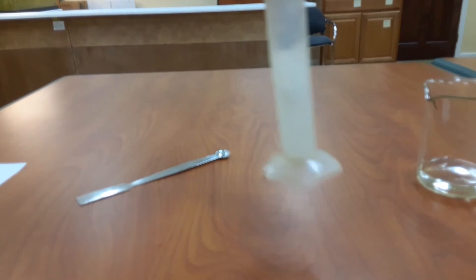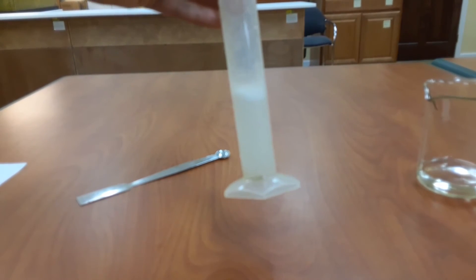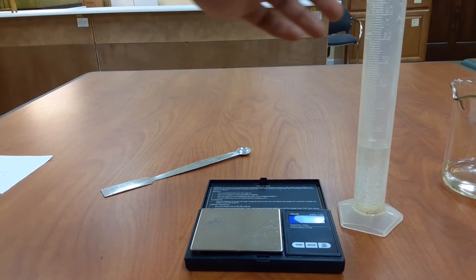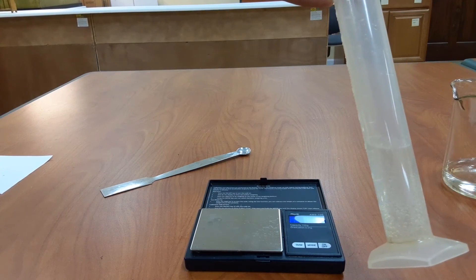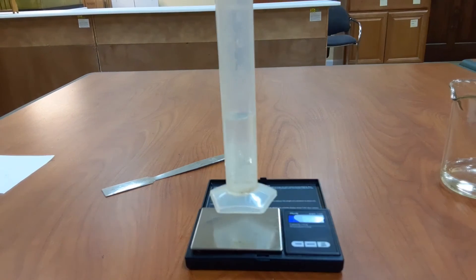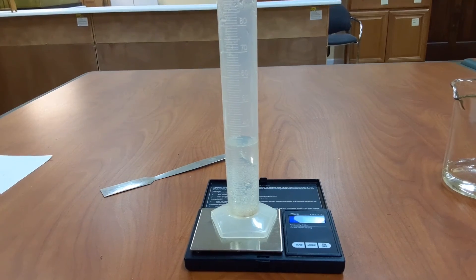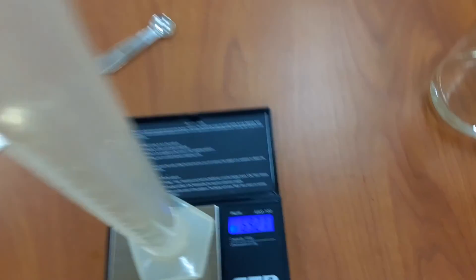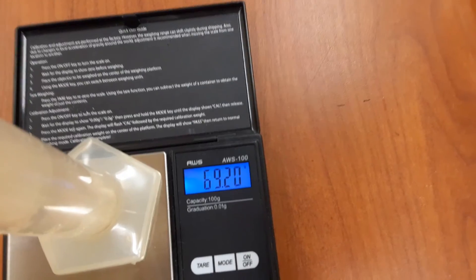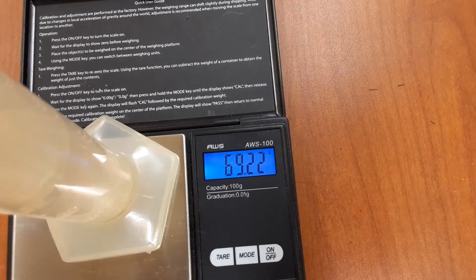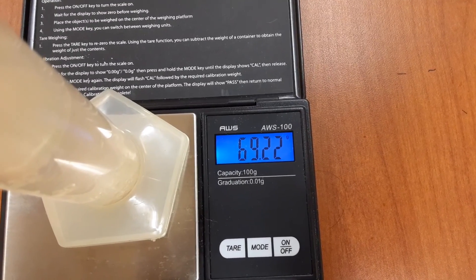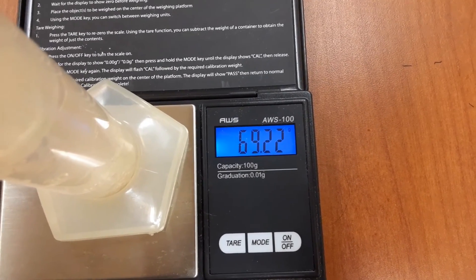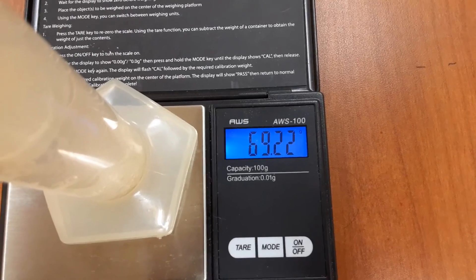In the graduated cylinder, the reaction is now complete. There's no more effervescence, so I can now find the mass of the graduated cylinder with the vinegar and the baking soda, and the mass is 69.22 grams. This is m_final.